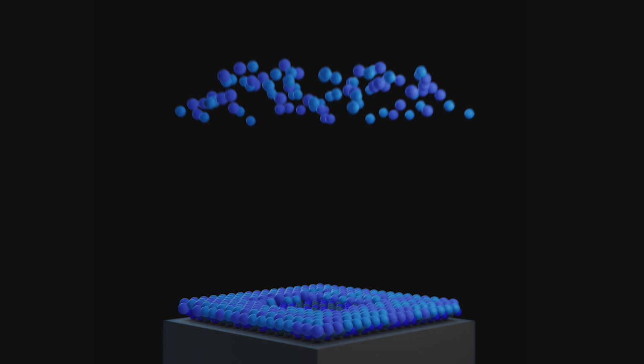This so-called slice and view approach allows larger-scale nanostructures to be characterized across the many imaging modes available to an SEM, including secondary electron, backscattered electron, and energy-dispersive X-ray measurement. The process is destructive since the specimen is being sequentially milled away after each image is collected. The collected series of images is then reconstructed to a 3D volume by registering the image stack and removing artifacts.